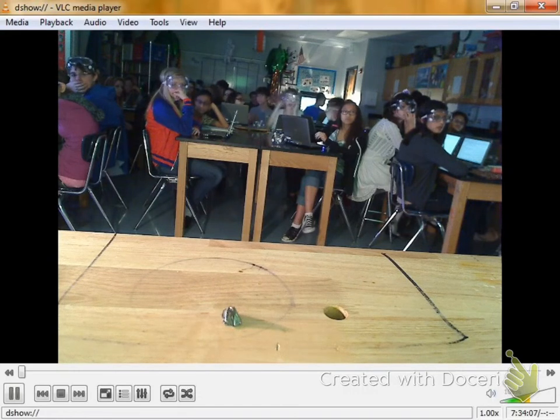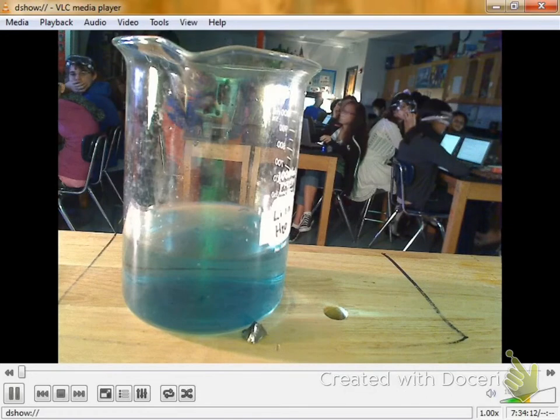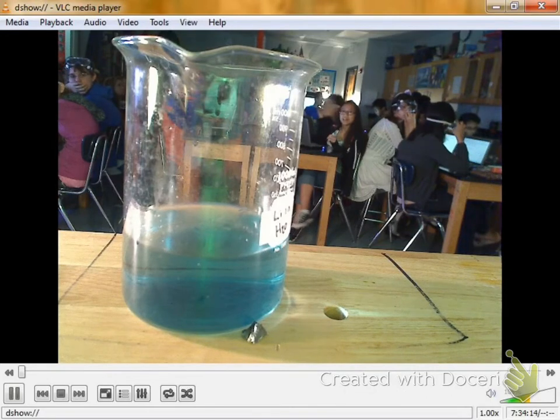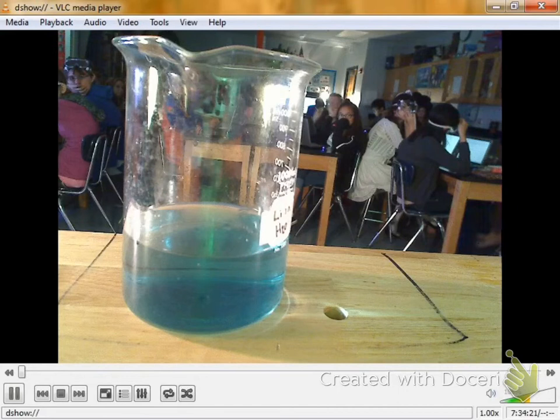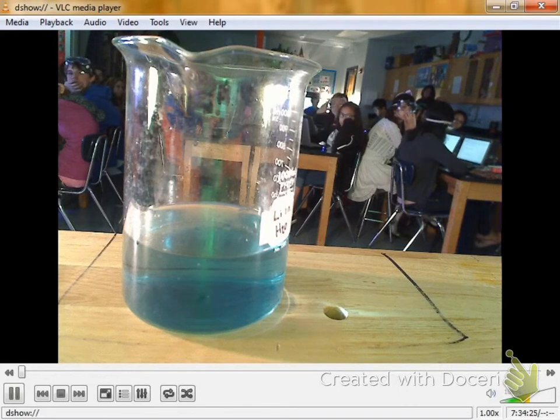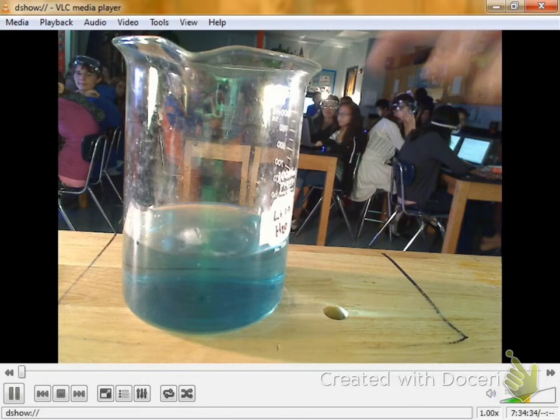Alright, so lithium. I'm moving one group to the left from where we were. And we always tell you that these guys are even more reactive. Remember, they're not found in nature by themselves because they like to bond with other elements. What do you think? It's going to react quickly, slowly? Quickly. Fire in the hole.